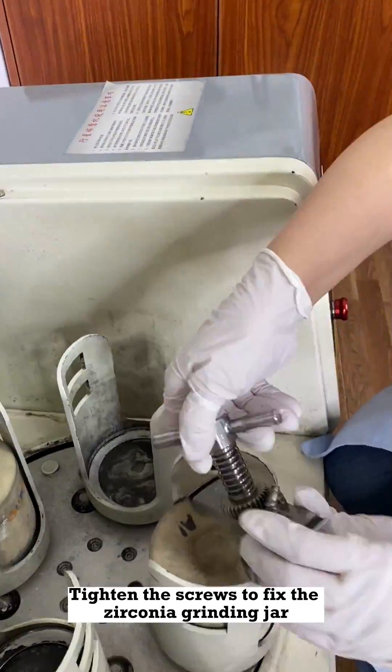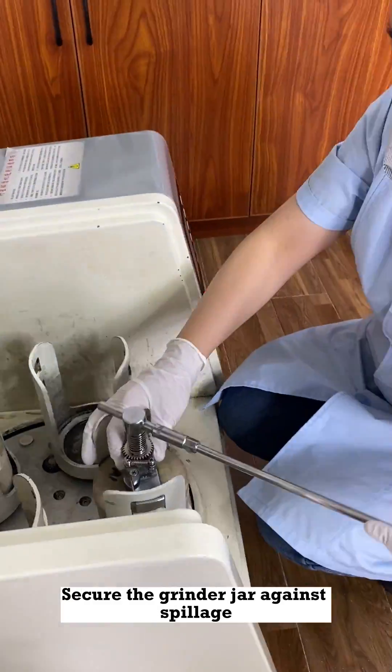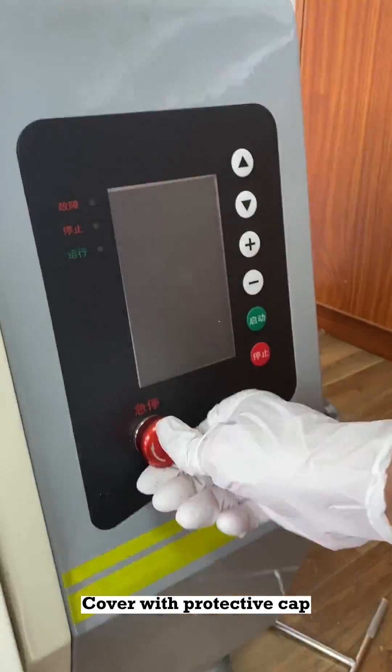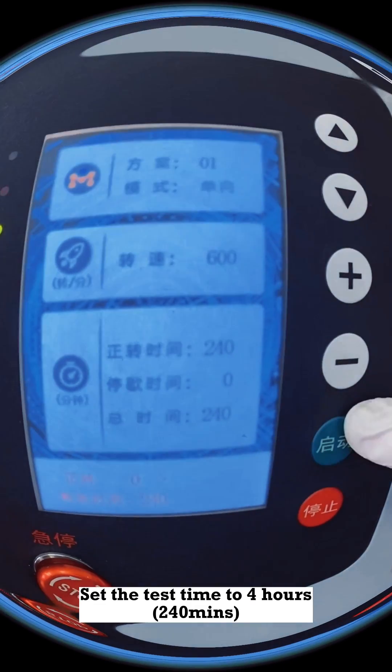Tighten the screws to fix the zirconia grinding jar. Secure the grinder jar against spillage. Cover with the protective cap. Set the test time to 4 hours.